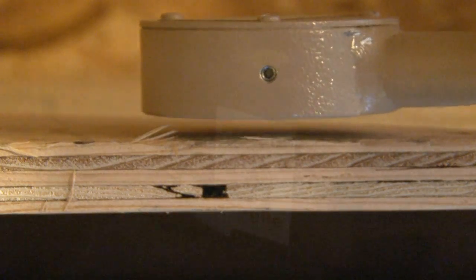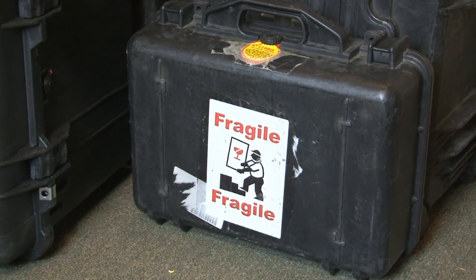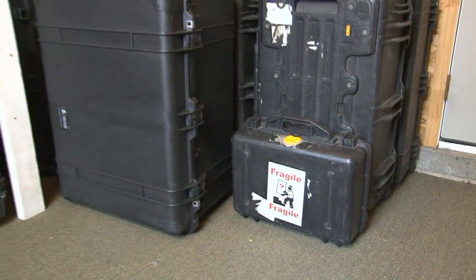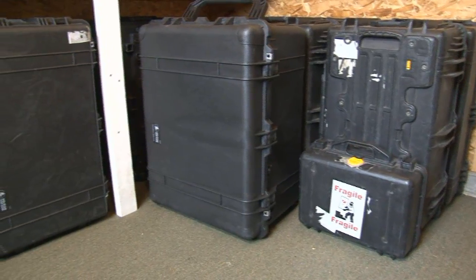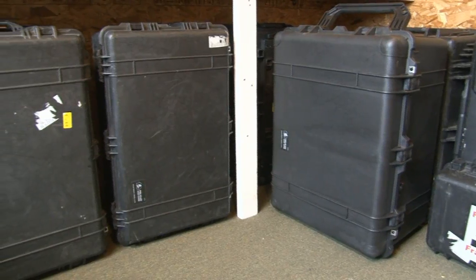The probe will also rupture above 8,000 feet in altitude, so you want to be careful if you're going to be shipping this via air in a cargo aircraft or something like that. You want to make sure it's in an airtight container. I use airtight Pelican cases to ship these and those work really well.